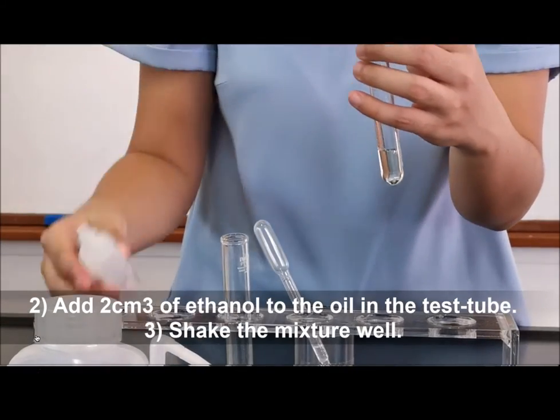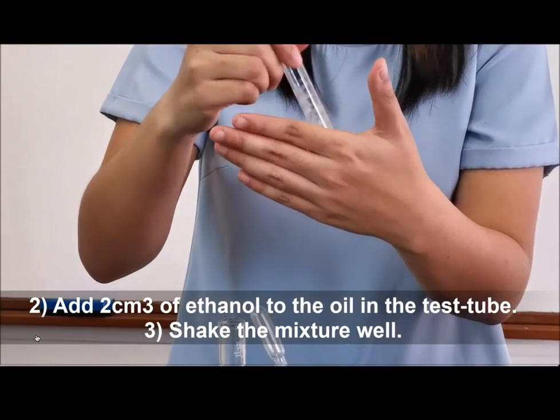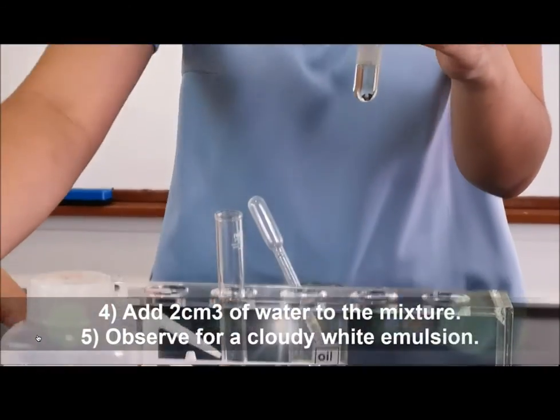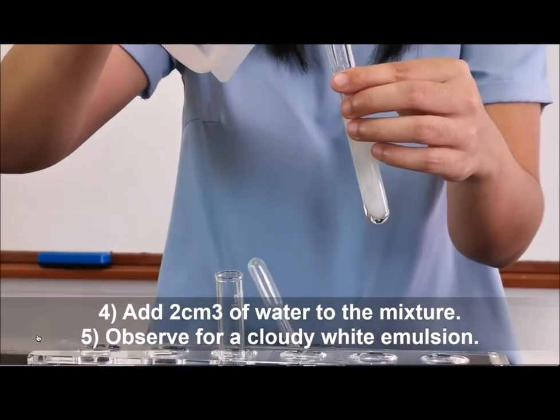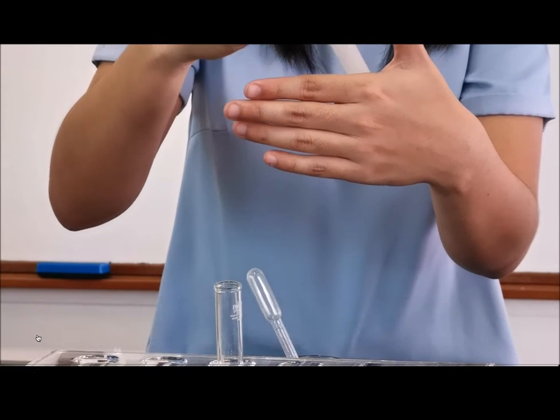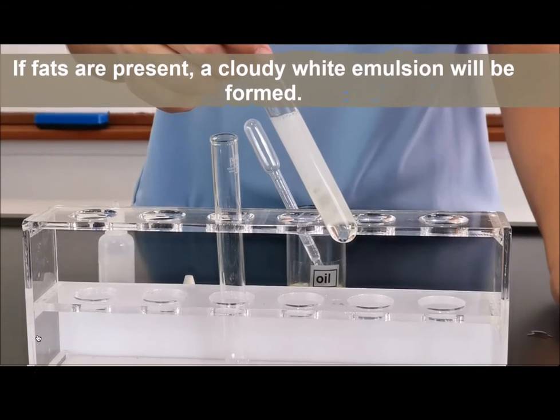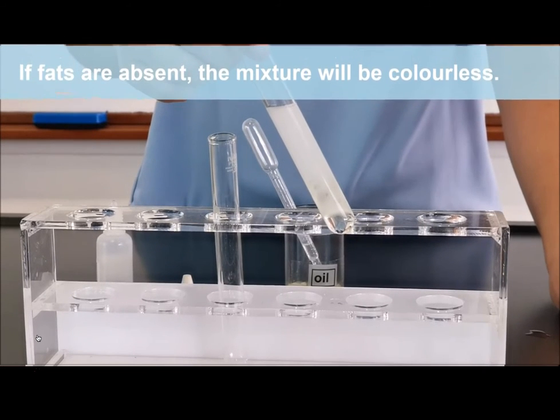Shake the mixture well. Add 2 cm cube of water to the same test tube. Observe what you will see. If fats are present, you will get this cloudy white emulsion. If fats are not present, you will get a clear solution.